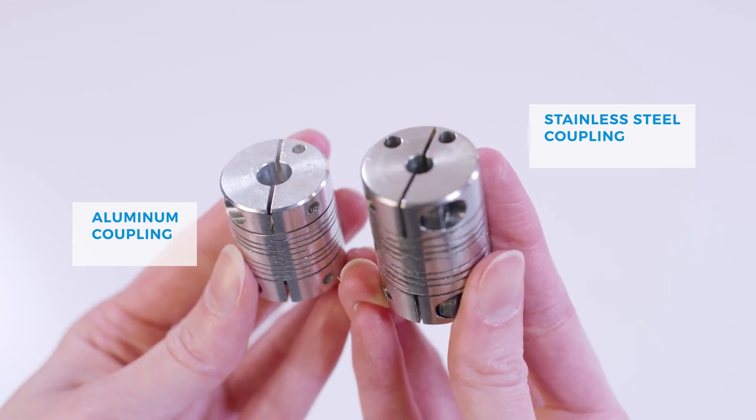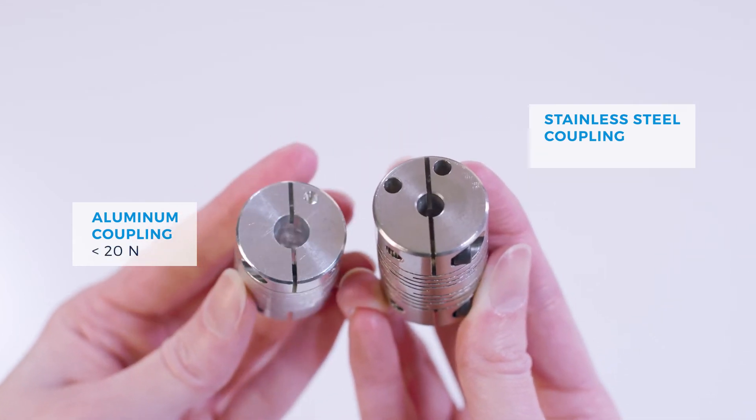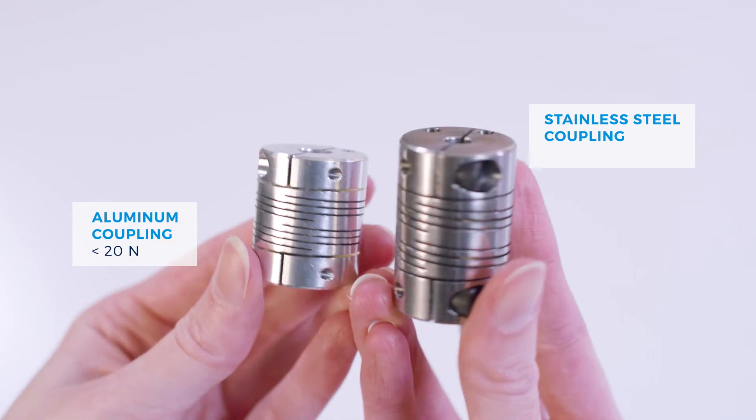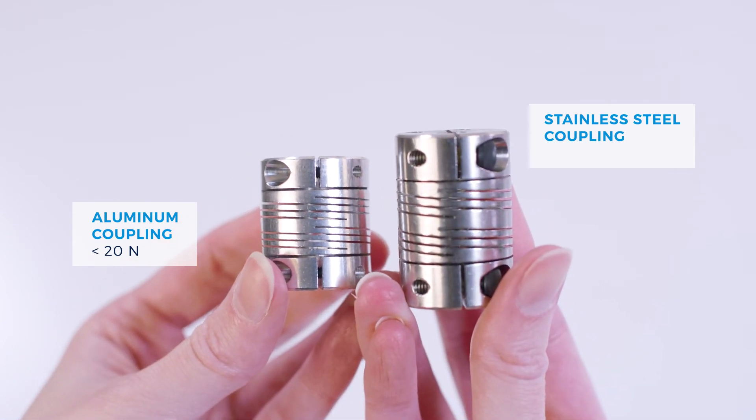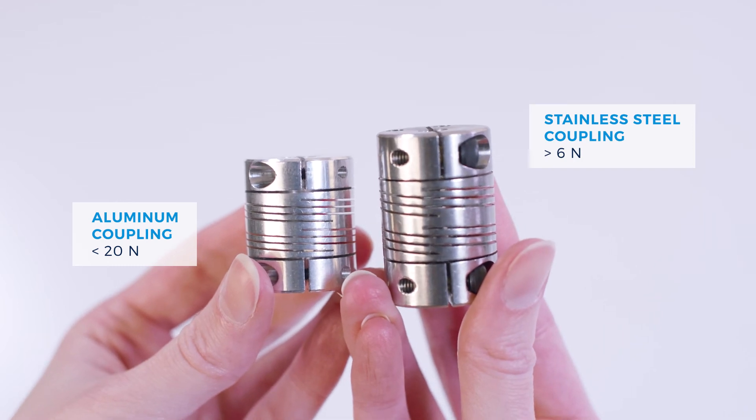In general, the aluminum coupling is commonly used for lower axial force testing, and the stainless steel coupling is used for higher axial force testing.